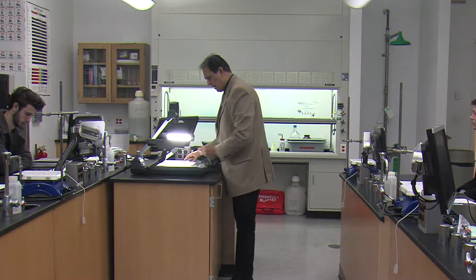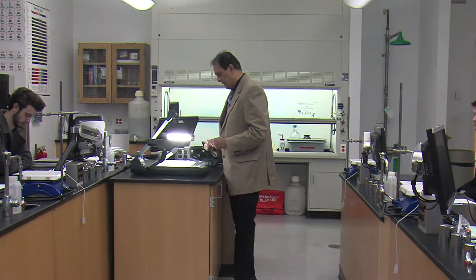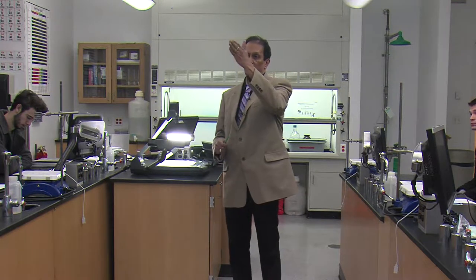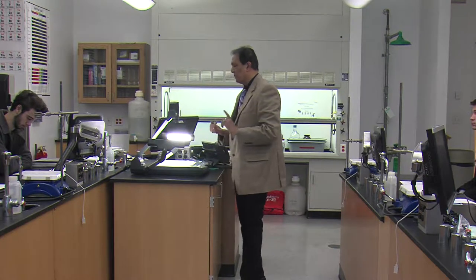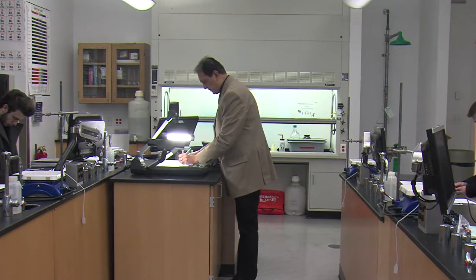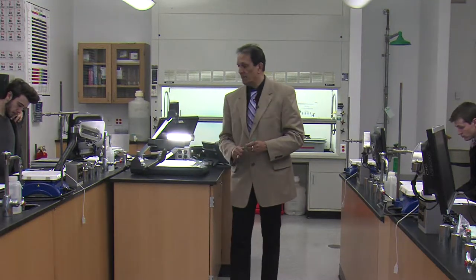Number 11, do not inhale or taste any chemicals, all right? Do not inhale or taste any chemicals. Any accident, spills, burns, or cuts should be brought to my notice so that we can treat you. If it is something minor, we can treat you with the first aid box over there. If it is something major, we'll call our campus police and they will take over from there, okay? But bring it to my notice so that we can attend to that. That is number 12.